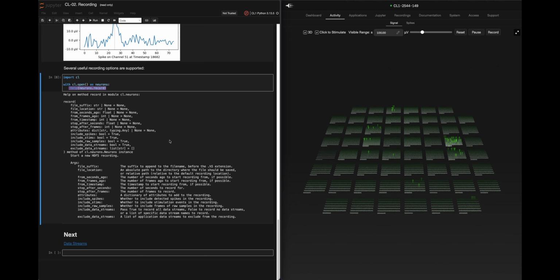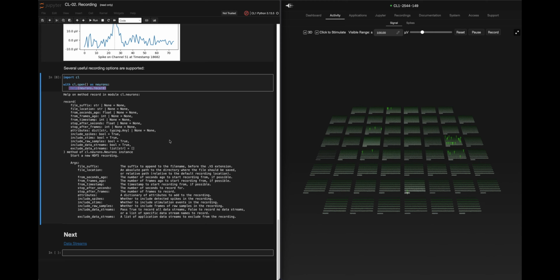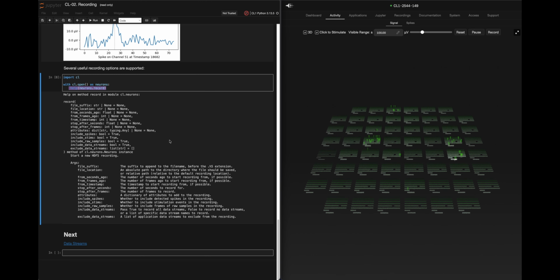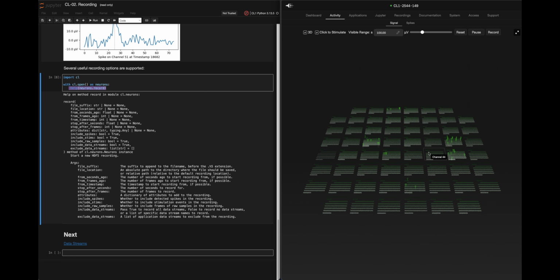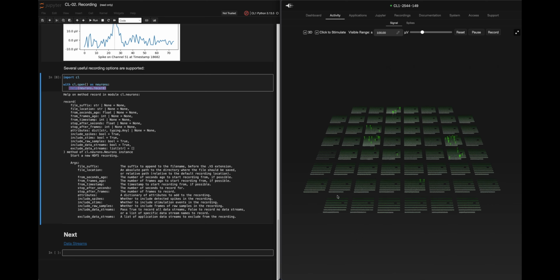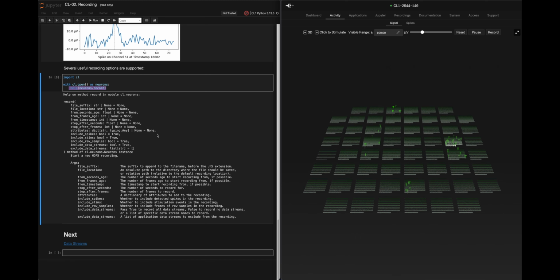And what does that mean? It means taking the best approach for what you are trying to accomplish. If you're trying to, for example, train the neurons to do something, that is one approach. If you're trying to potentially be more on the side of recording what they're doing, I know that these devices are used in a lot of neurotoxicity studies, for testing drugs. But it's very important to be able to fit the code to what you need to do and what you want to accomplish.